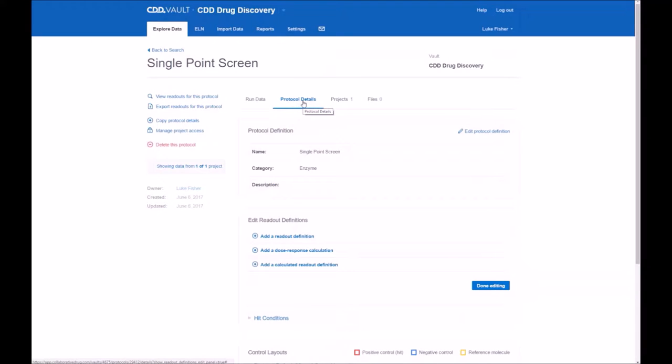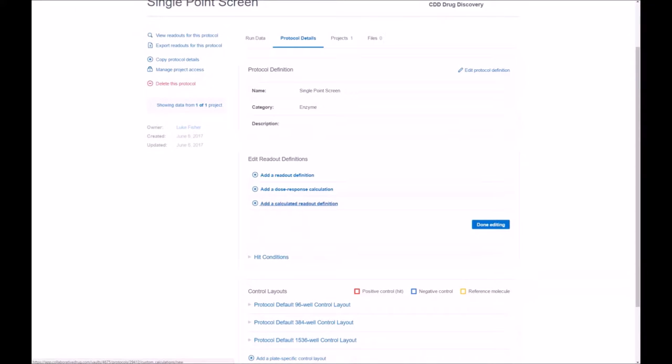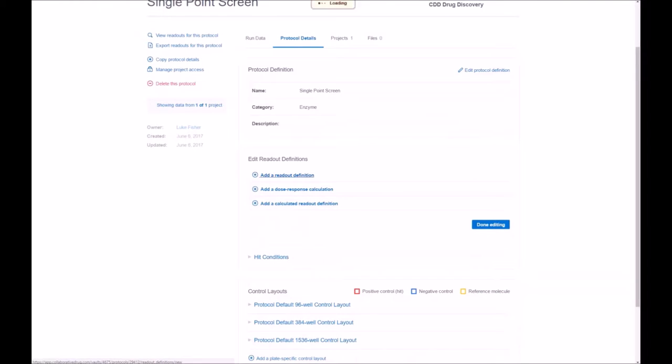On this screen, the protocol details. This is where we're going to add those readout definitions. So we're going to read in inhibition and SEM, and then also calculate the average inhibition and average SEM.